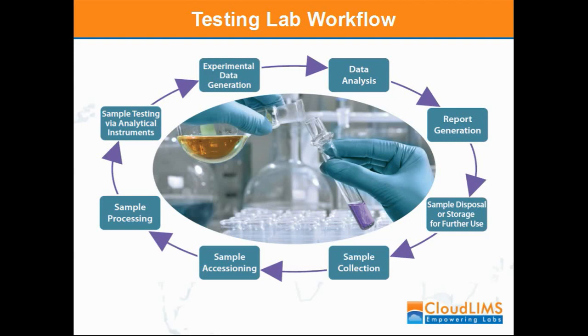The sample then is processed using standard procedures that assure integrity of the sample and makes it ready to be analyzed using any analytical instruments. The experimental data is then generated, followed by data analysis and report generation. The report generated is then sent to respective clinicians or physicians in quick time. The analyzed sample is either disposed or stored for further use.